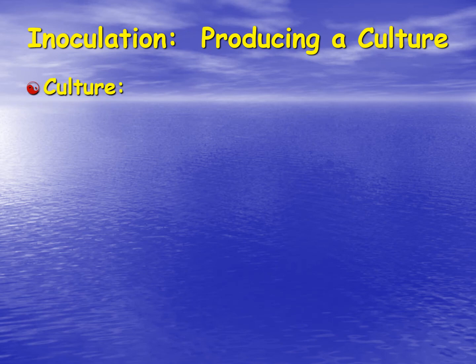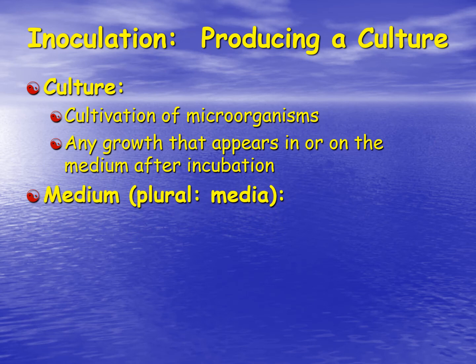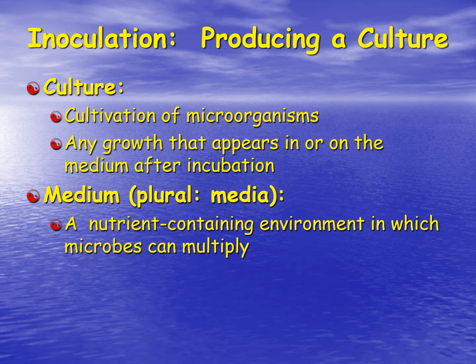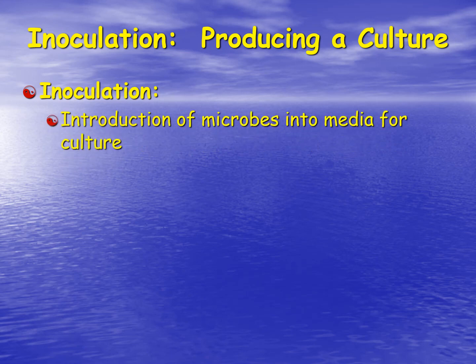So, inoculation, producing a culture. A culture is literally the cultivation of microorganisms. Any growth that appears in or on the media after incubation is considered a culture. The medium or media is a nutrient-containing environment in which microbes can multiply. This can include artificial medias or living tissues. Inoculation is again the introduction of the microbes into the media for culturing.